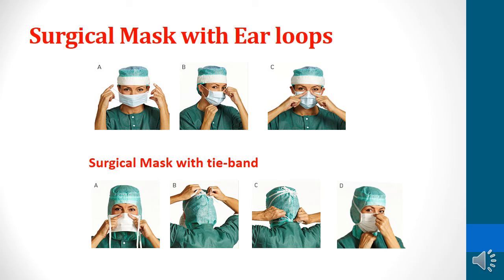This is a photo showing a surgical mask with ear loops, and the second one, a surgical mask with a tie band.